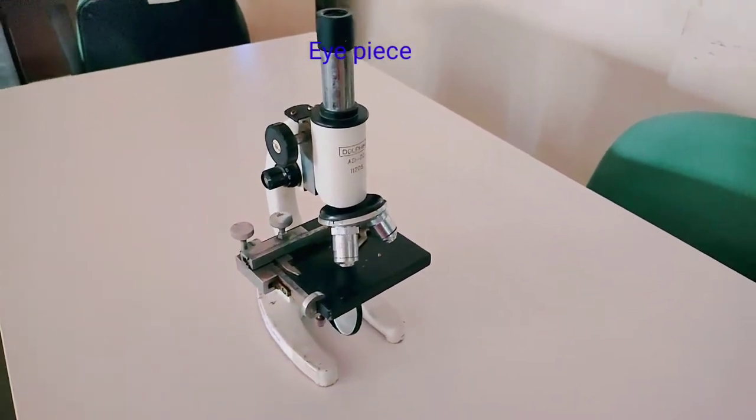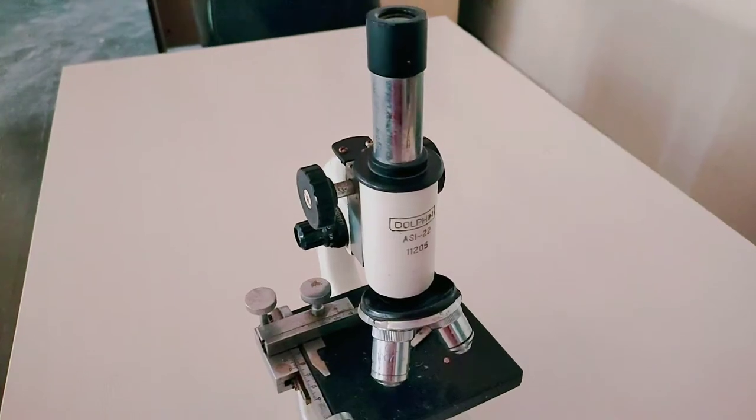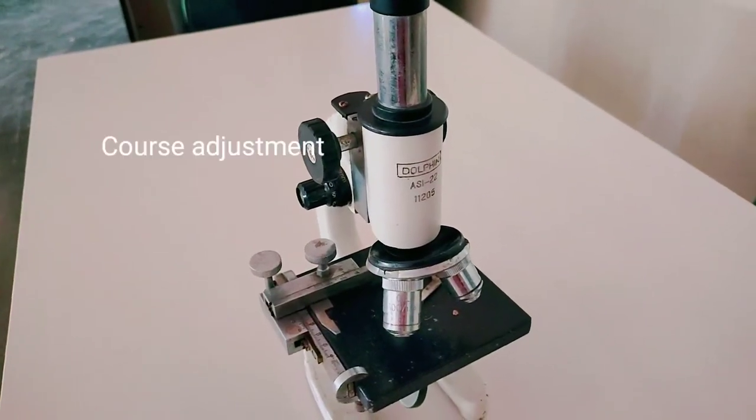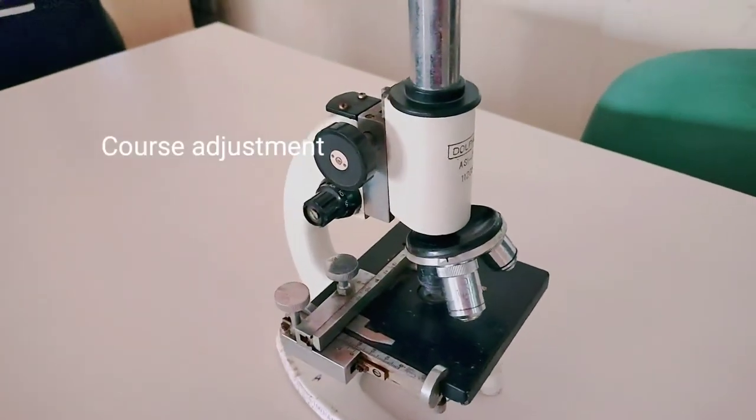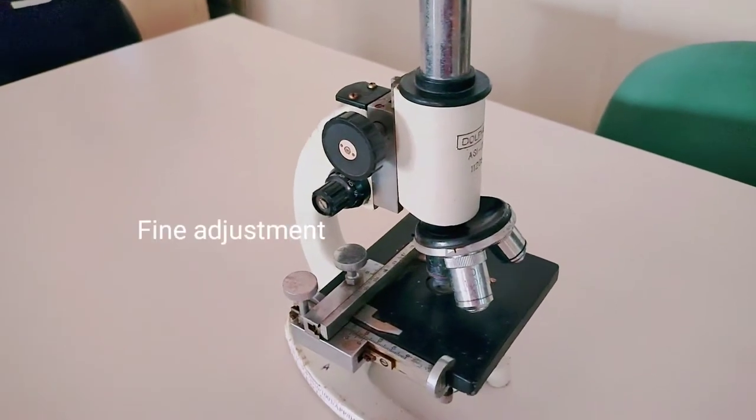This one is the eyepiece, then body tube, after that we have objective lens, stage, coarse adjustment screw, then we have a fine adjustment screw.